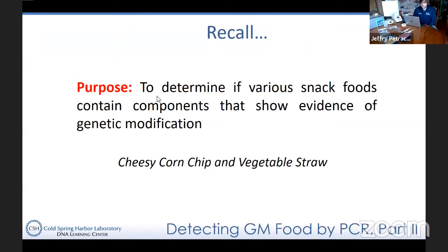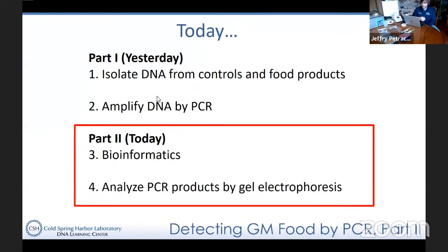Just as a reminder, if you've watched part one — or if you haven't, I would encourage you to do so before you watch part two. Remember that the purpose of this lab was to try to figure out if we could find evidence of genetically modified plant components within various different snack foods. We looked at, in particular, a cheesy corn chip as well as a veggie straw. We began by isolating DNA from both of those snack foods. I also isolated DNA from a positive and negative control — GMO corn and non-GMO corn.